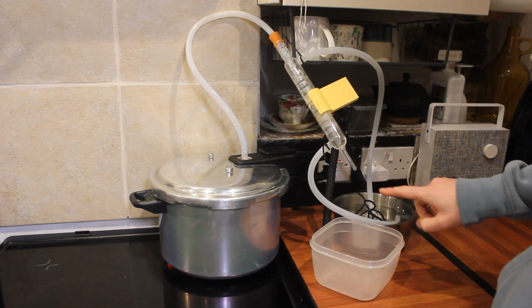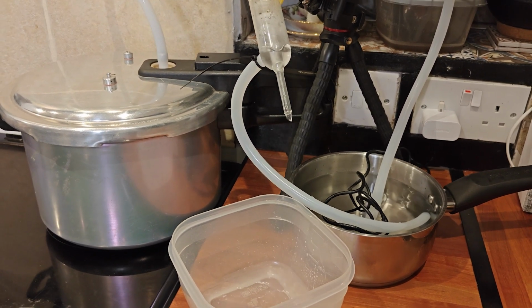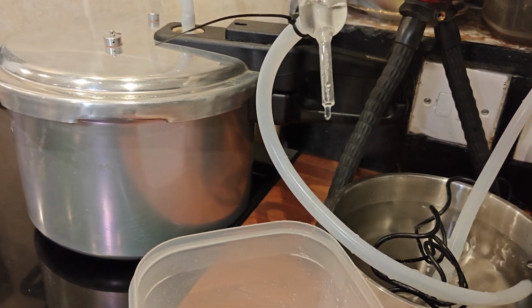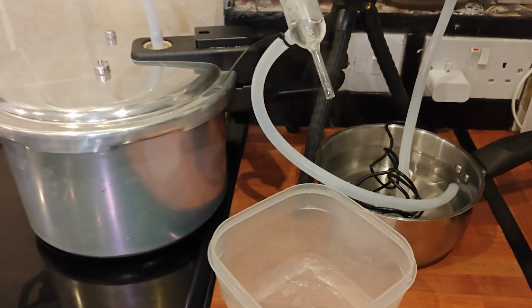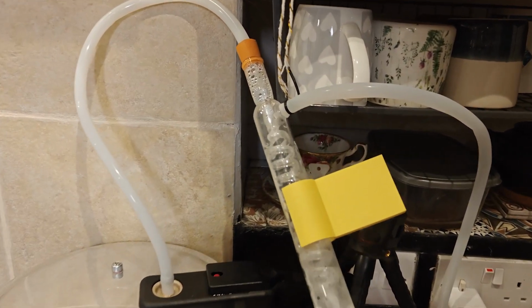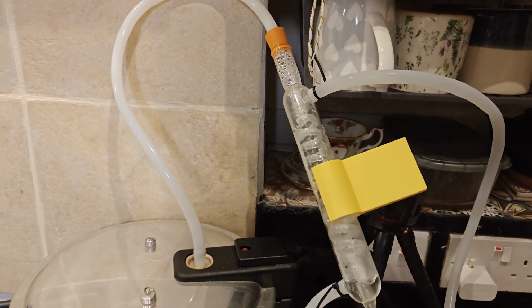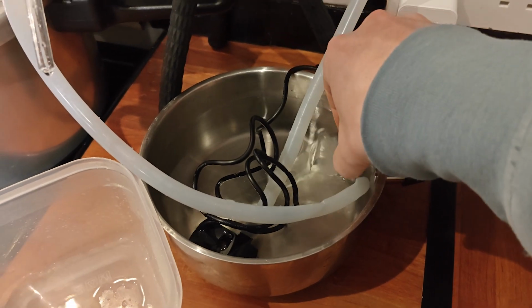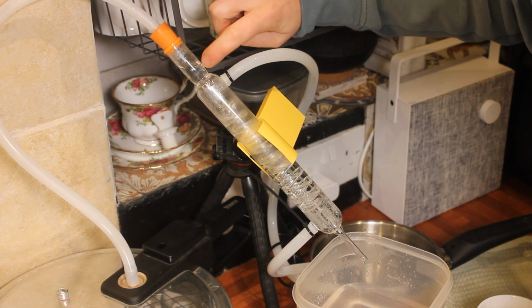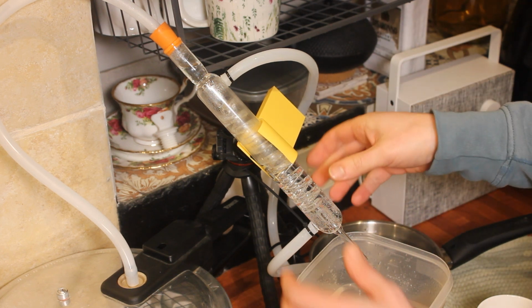Everything's got to be sealed, and now this is dripping like mad. I've got some serious drips coming out the bottom. Looks like we've got steam as well, to be honest, which isn't ideal. This is a lot more than first time round. Add some more ice to the cooling water. I've seen there's a big build-up of liquid up here, and that is actually inside the condensation tube, so this must have to come out, right?